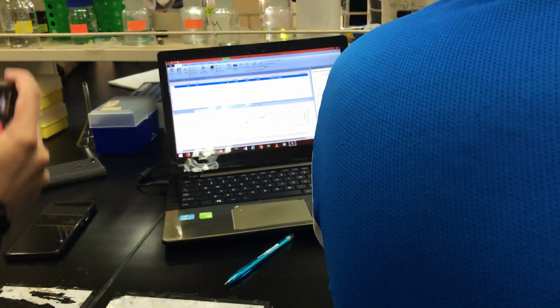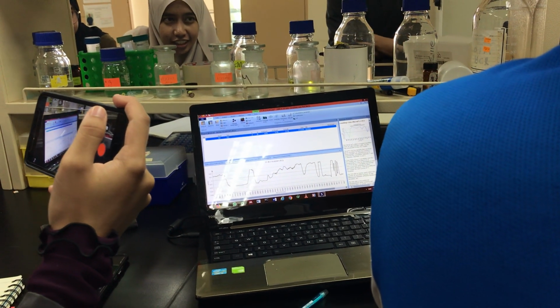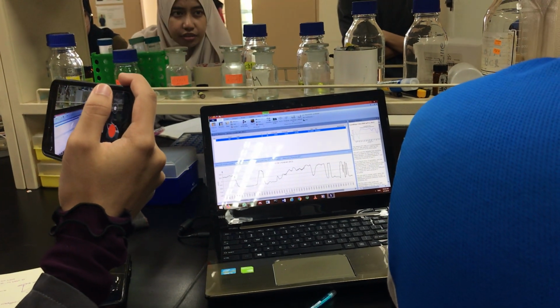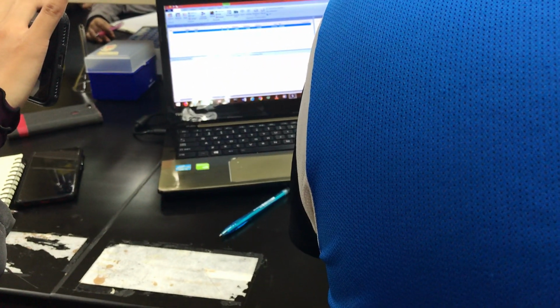That means we extract high polar and non-polar, and all show high activity of antioxidant. There should be one non-active or less active extract. But in your case, all are above 90%. Why is it like that?